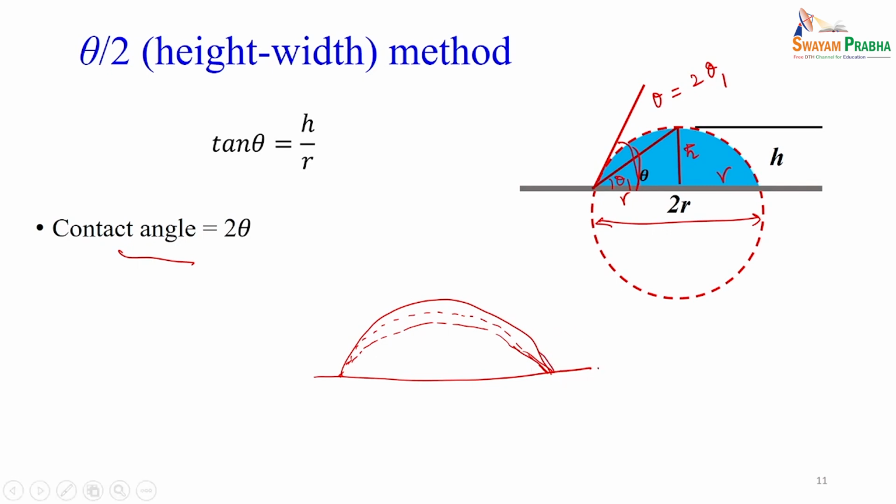This time frame typically takes about 0 to 60 seconds.